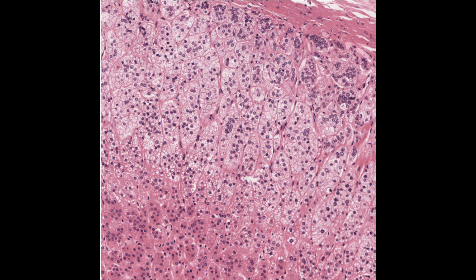This slide shows a cut section of the adrenal cortex. This is the capsule. The zona glomerulosa contains closely packed, rounded or arched cords of columnar or pyramidal cells. The zona fasciculata contains pale staining cells arranged in vertical columns of one cell thickness adjacent to straight capillaries. The zona reticularis contains heavily stained acidophilic cells arranged in cords or clumps interspersed with wide capillaries.